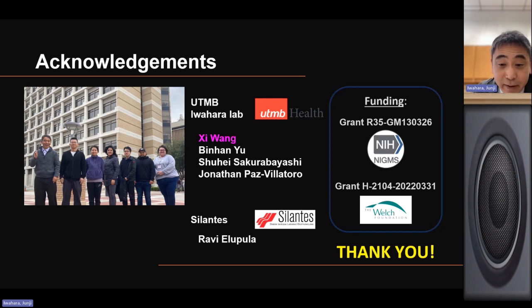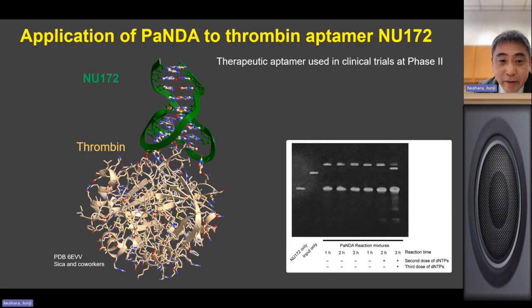So let me show something here. Do you see my slide? Yes. Okay, so this is basically a time course. This is the reaction at 1 hour, 2 hours, and 3 hours, and you don't see much difference, right?